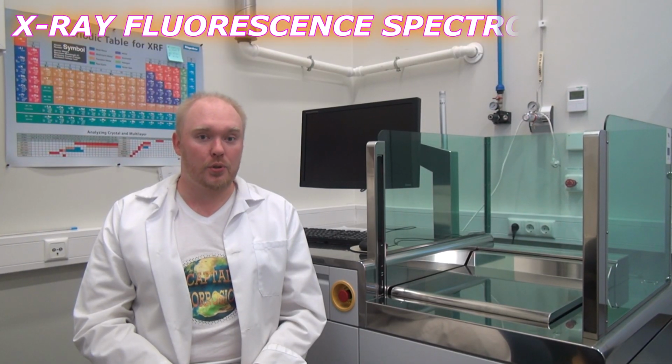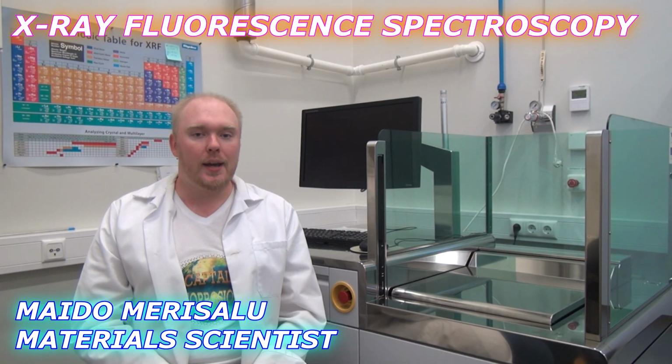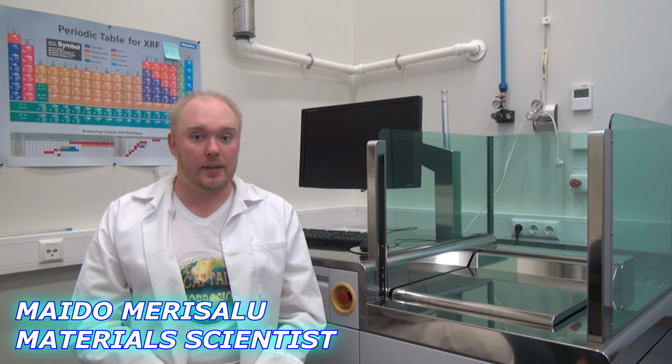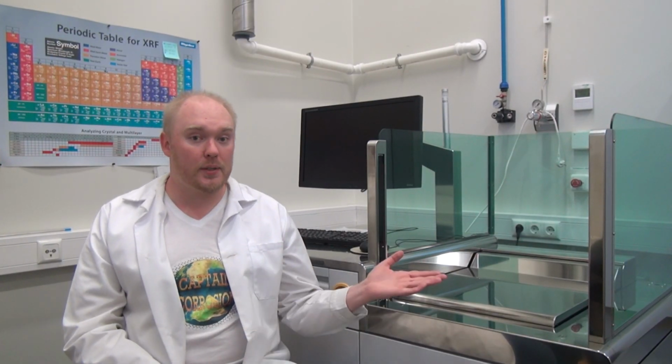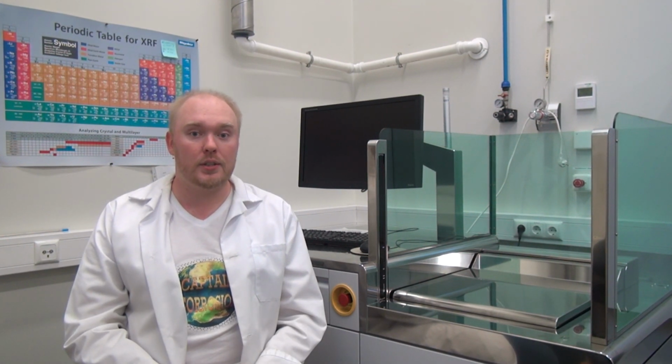X-ray fluorescence spectroscopy. Welcome to Captain Corrosion, my name is Maido, and in this video you will learn the basics of this technique. And at the end of the video I will use this spectrometer over here to measure the elemental composition of a 300-year-old coin. So let's get started.